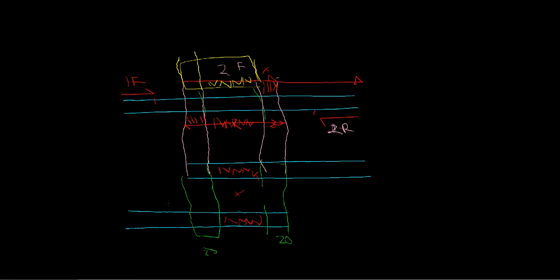And then we can begin the actual SOEing reaction. So again, in the SOEing reaction, it's important to pay attention to our 5' and 3', and I'm realizing now I've done this kind of backwards with respect to how I was doing the other ones. So in this case, we're going to be paying attention to the middle strands.